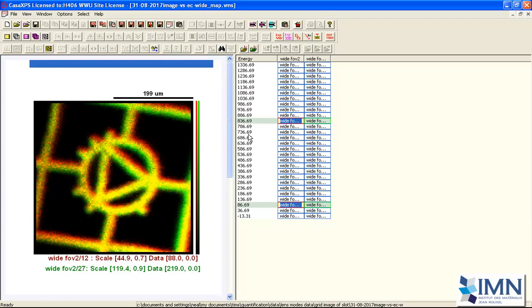We've got, again, the Fluorine 1s, the Fluorine 2s, and I've overlaid these images, and this mode has been very carefully set up so we get good image registration, and the quality of the image is also good throughout the energy range.